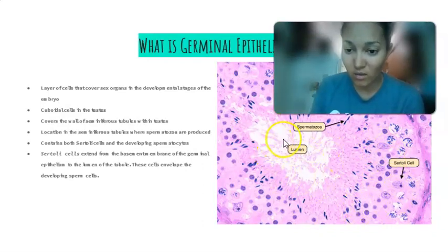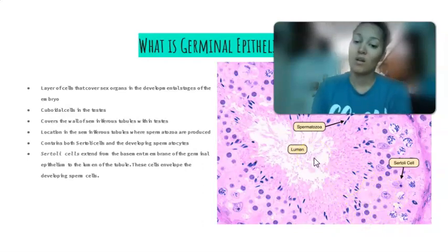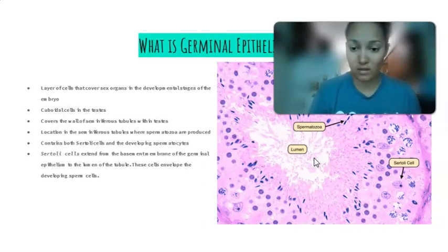And here in the center is the lumen. So as they're developing and moving on to their different phases of development, they are pushed more towards the center, to the lumen, where they'll eventually be released. And we'll talk about that in a few slides.